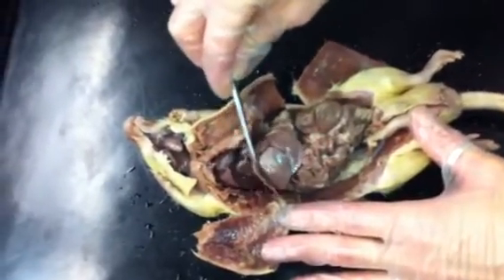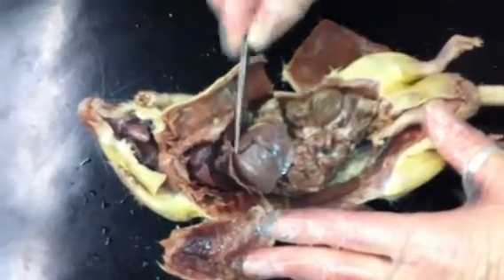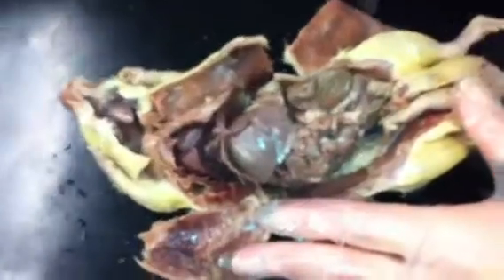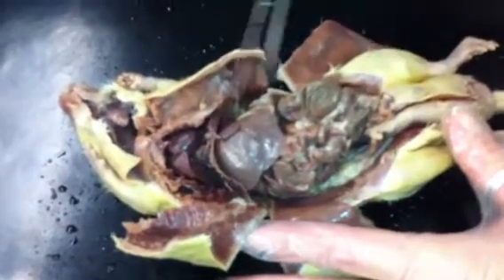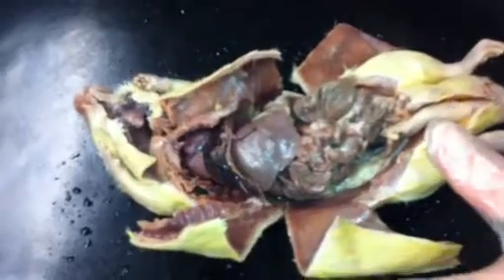So, this is the diaphragm here, and you can use the diaphragm as a landmark to help you identify what's above the diaphragm is the thoracic cavity, and what's below the diaphragm is the abdominal pelvic cavity. And certain organs are only going to be in the thoracic cavity or the abdominal pelvic cavity. So if you can find the diaphragm, then it helps you kind of eliminate what organs it couldn't be.